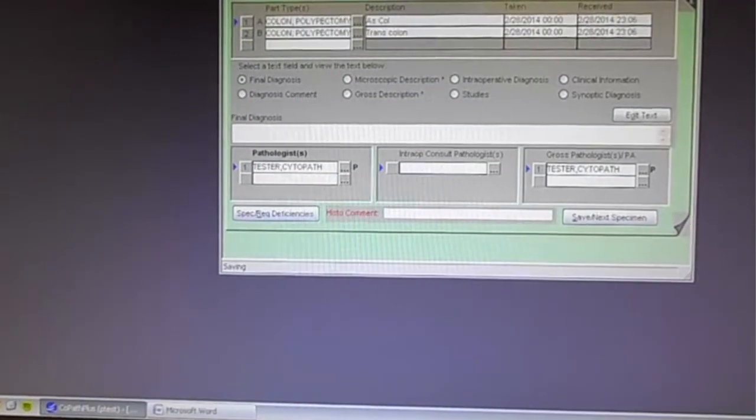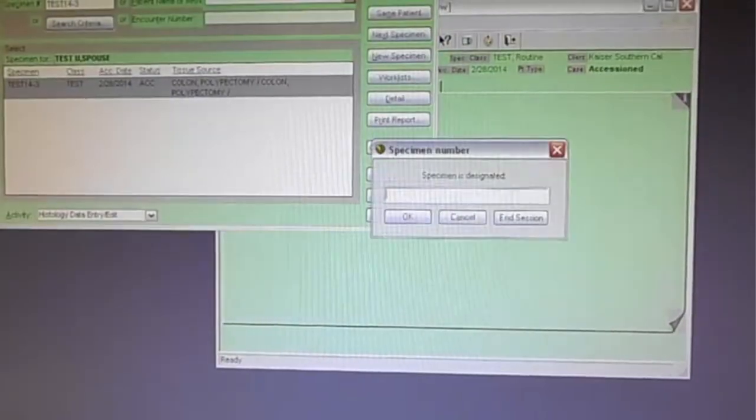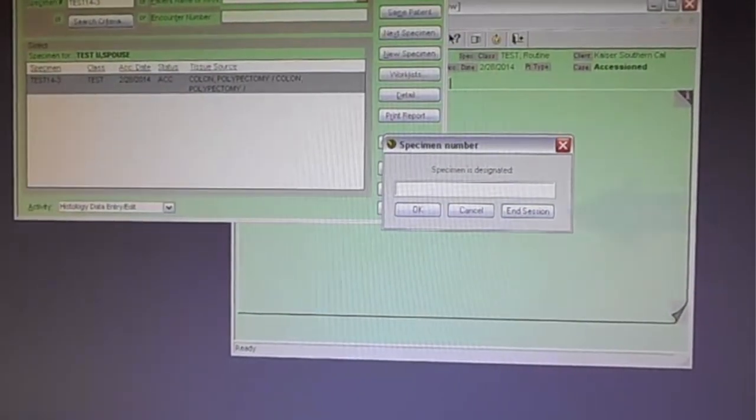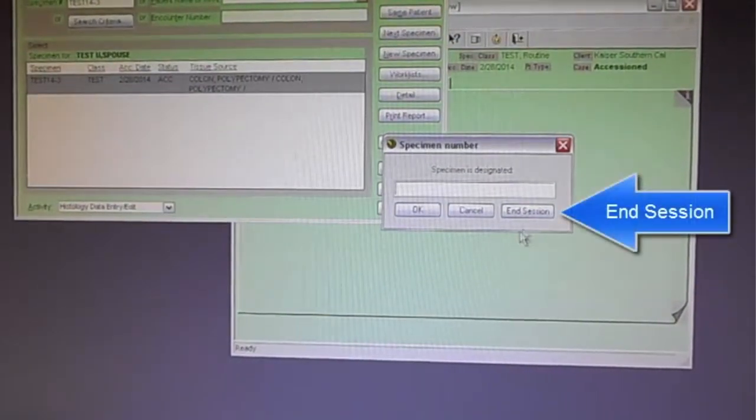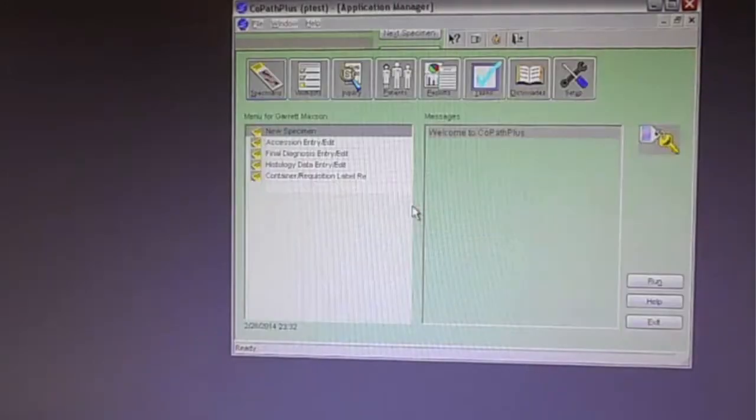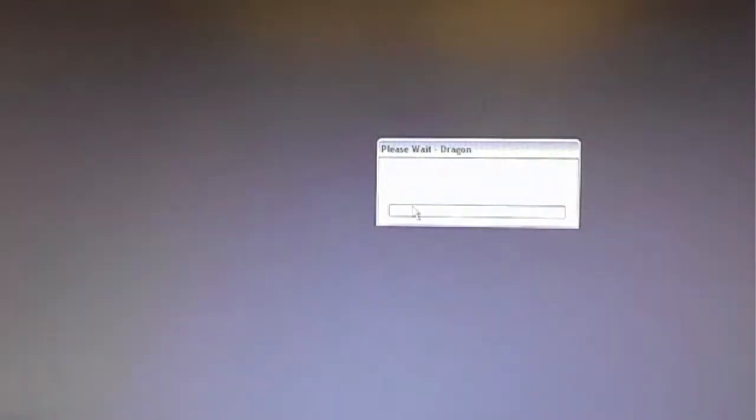And now we are going to lose her. And it is going to continue on because when we finish, she wasn't finished grossing, but on my computer I can show that that is the end of the demonstration by when this specimen is designated there is a third button that says end session. When I press that button, CoPath is closed down and Dragon is closed down automatically.